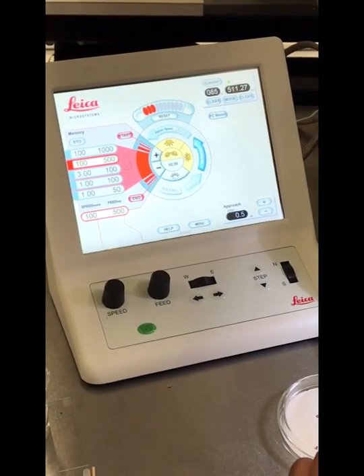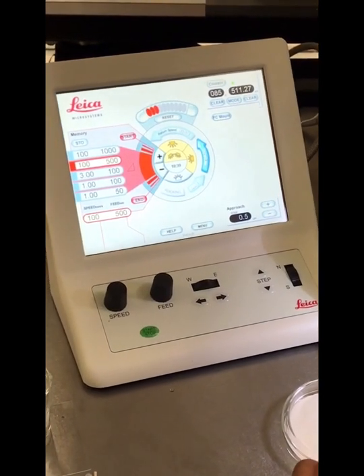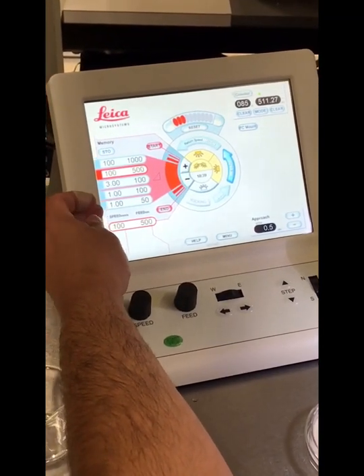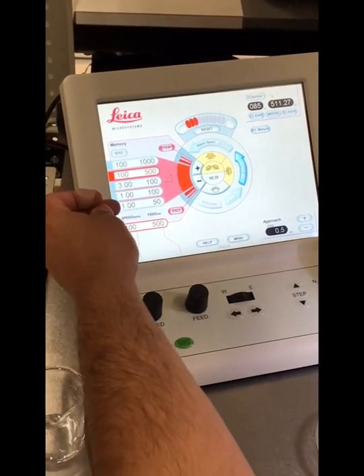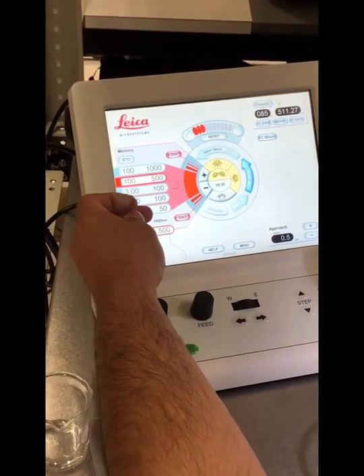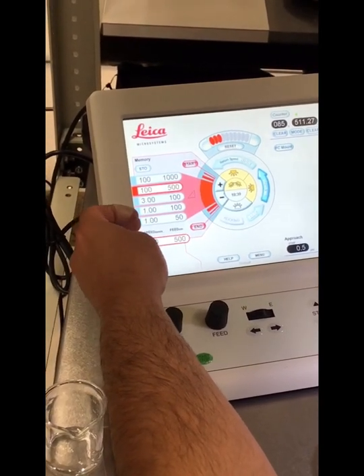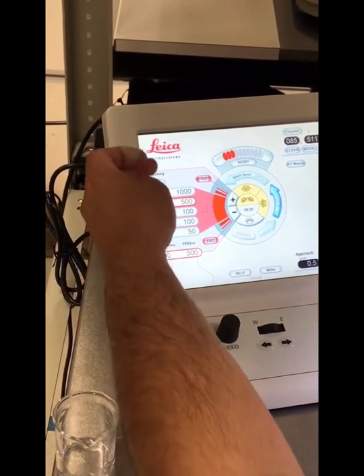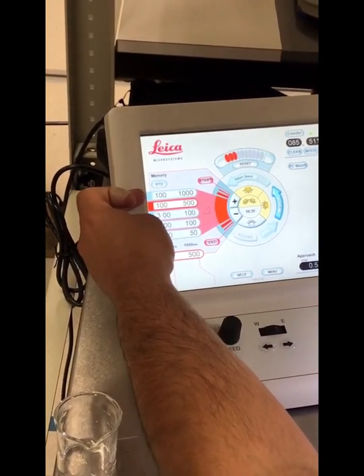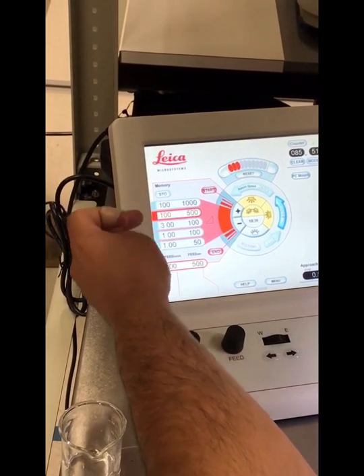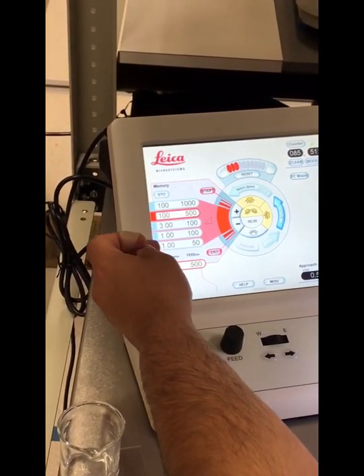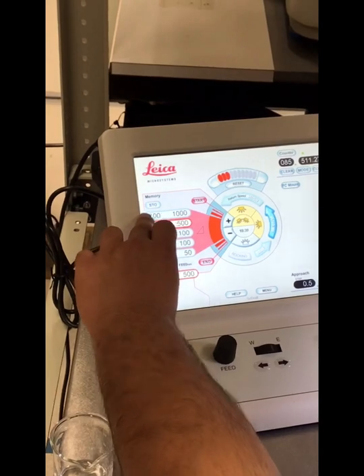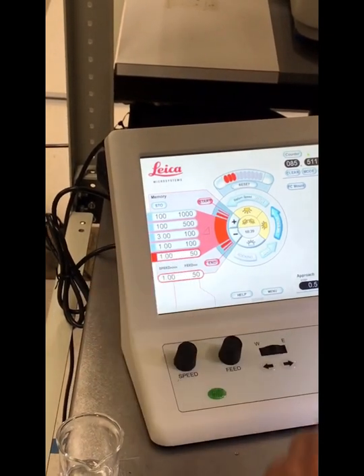So for our thin sections, using the diamond knife, we'll want to use a setting here that has a shorter feed distance. So for this particular case, we'll be using 50 nanometers because we want thin sections which are 50 to 70 nanometers thin. And again, the thick sections that we cut earlier with the glass knife are one micron thick. And our ultra-thin sections will be 50. And as you can see, it goes from 100 speed to 1.00.